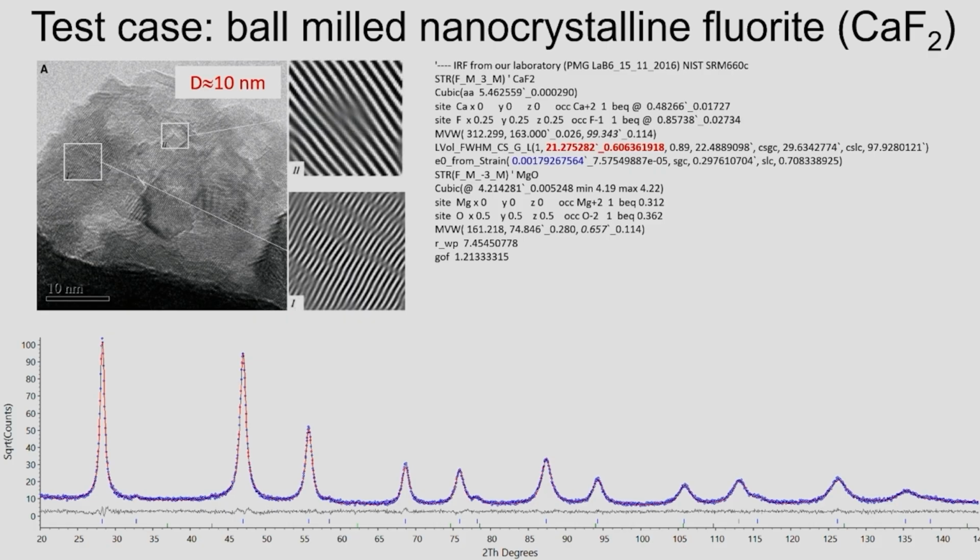So using the square root in the intensity puts the data on a sort of fair basis, higher counts and lower counts. And to be honest, they always look better. It's a little trick. You always want to look at linear, square root, and logarithmic. Don't fool yourself, but square root is fair for the counting statistics.